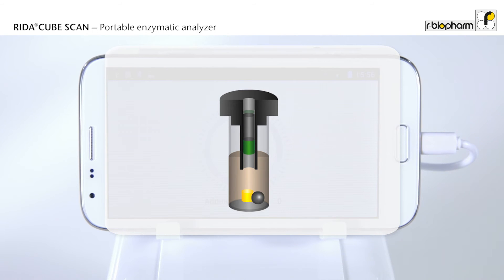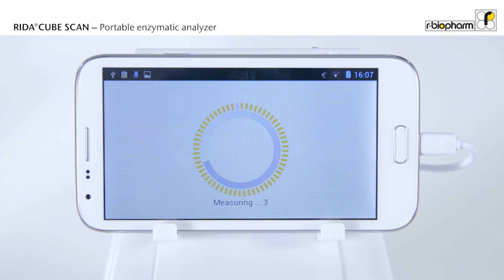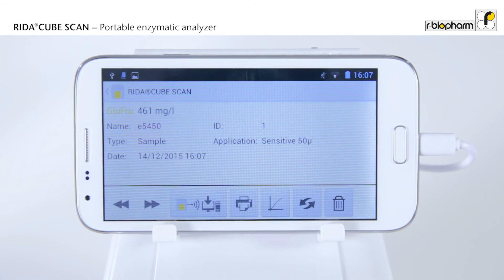There is no pipetting device, so the instrument does not require any maintenance and is extremely robust. The incubation time takes 10 minutes. The instrument measures the absorbance and the RIDAR CubeScan immediately calculates the result.